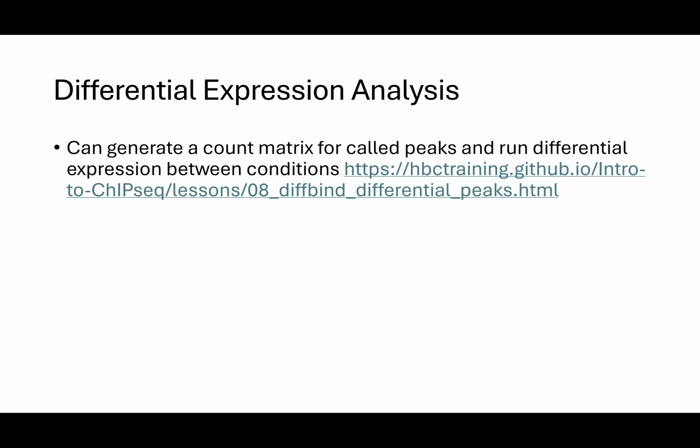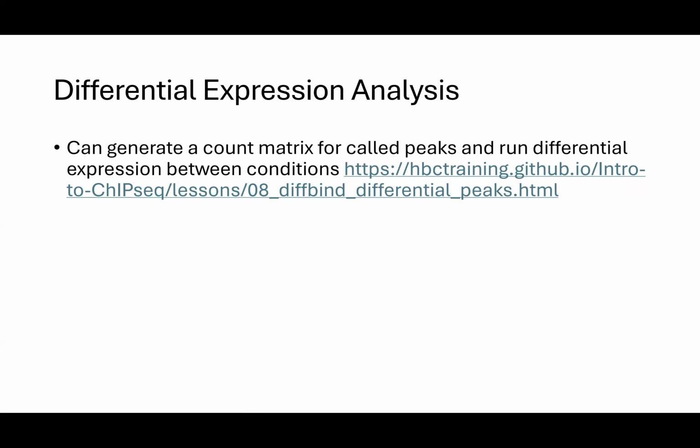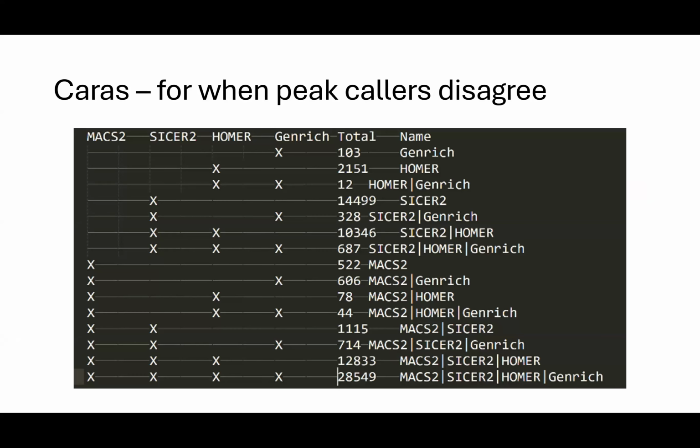You mentioned you put a threshold to define the peak. Is the peak binary? Usually, yes, it's defined as binary. For calling peaks, it's basically just trying to find which regions of the genome are important, kind of like what the genes are, almost. To get counts, you would run separate software with your peaks and your reads. Now that I know what regions are important, how many reads did I actually have lined up with those? So you have to go back to the counts. Calling the peaks is basically finding the regions that actually matter in this data set.